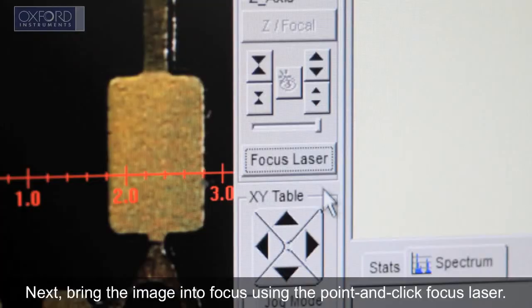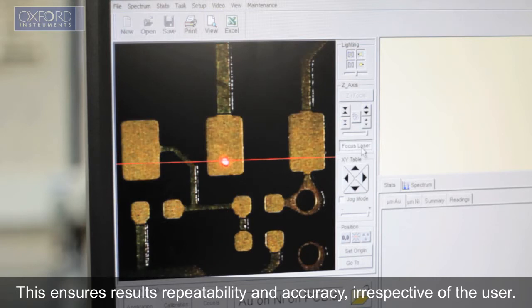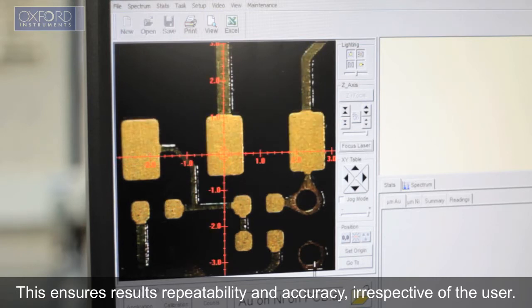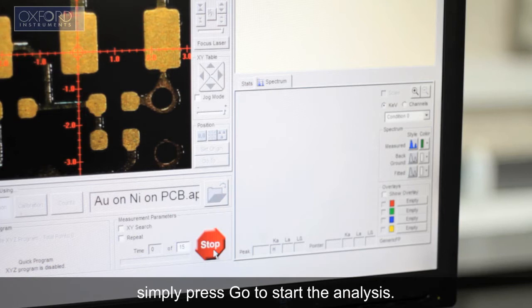Next, bring the image into focus using the point-and-click focus laser. This ensures results repeatability and accuracy, irrespective of the user. When all measurement points have been defined, simply press go to start the analysis.